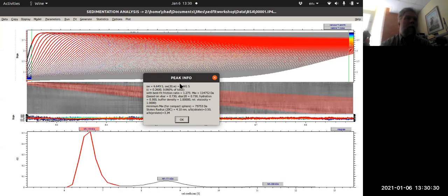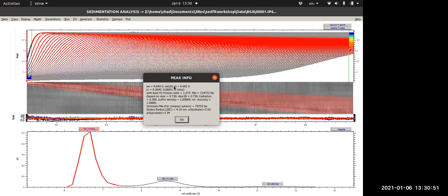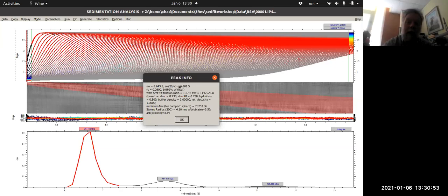And that means that if I do my experiment in 500 millimolar saline, and you do yours at 150 millimolar saline, the difference in density in our two experiments isn't going to matter. We should have the same S20W. So the 20 corresponds to 20 degrees Celsius. The W corresponds to aqueous or just water-only conditions for your protein's solution. It's a standard, and this is the number you'd want to report, so this is a good thing to write down.